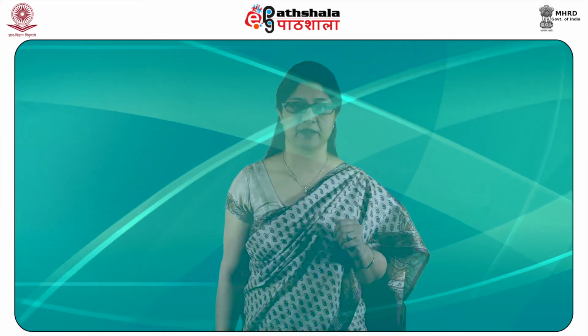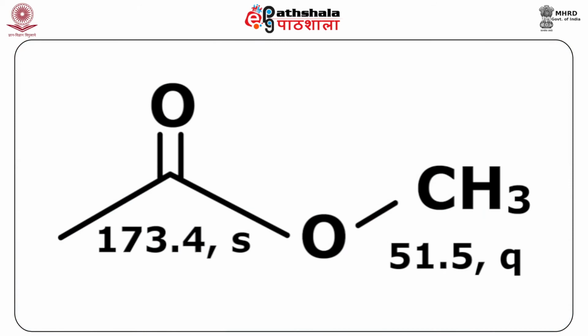The presence of the carbonyl group is confirmed by the peak at 173.4 in carbon 13 NMR. Thus, it accounts for the only double bond present. From carbon 13 NMR, it is concluded that the peak at 173.4 is for the carbon attached to no hydrogen, which is a carbonyl group, and 51.5 is for the carbon attached to 3 hydrogens, which is CH3. Therefore, these two peaks together indicate the presence of the structure C double bond O, OCH3.